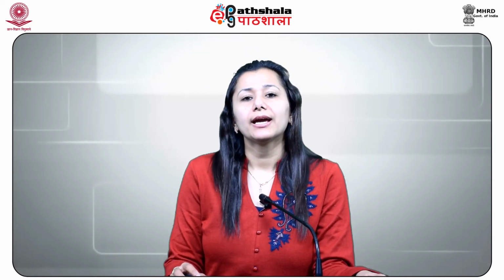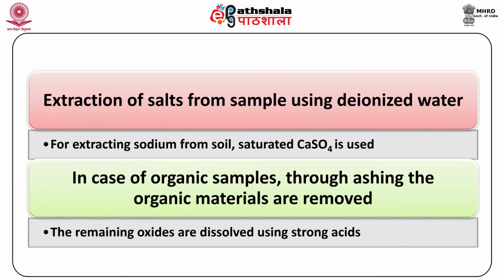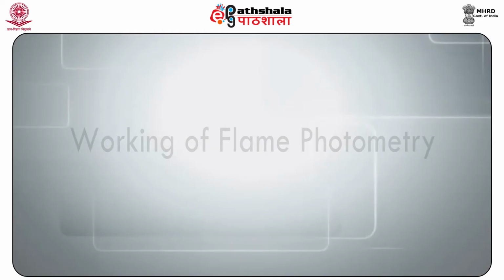Now, we shall have a look at the sample preparation. If the sample is not in liquid form, then it is converted into an aqueous medium, which can be directly introduced into the flame photometer. Changing the solid sample into aqueous media can be achieved by a number of steps. For example, extraction of salts from the sample using deionized water. For instance, for extracting sodium from soil, saturated calcium sulfate is used. In case of organic samples, through ashing, the organic materials are removed and then the remaining oxides are dissolved using strong acids.